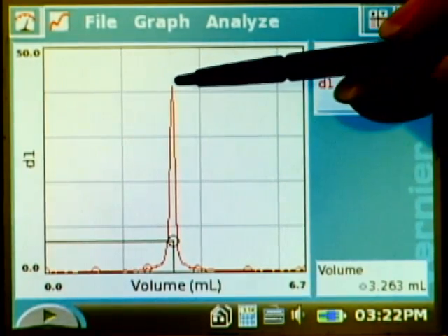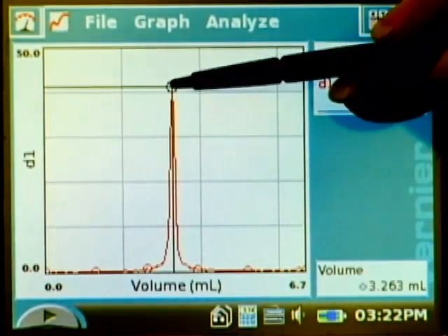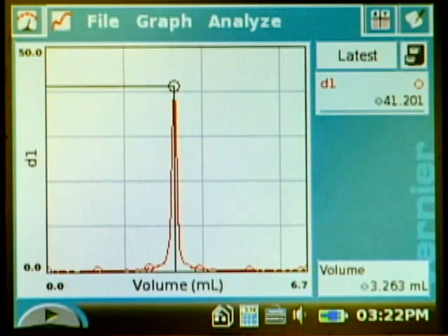The equivalence point would be at the peak of that right there. A volume of 3.263 milliliters would be our equivalence point using the first derivative as a method to find that.